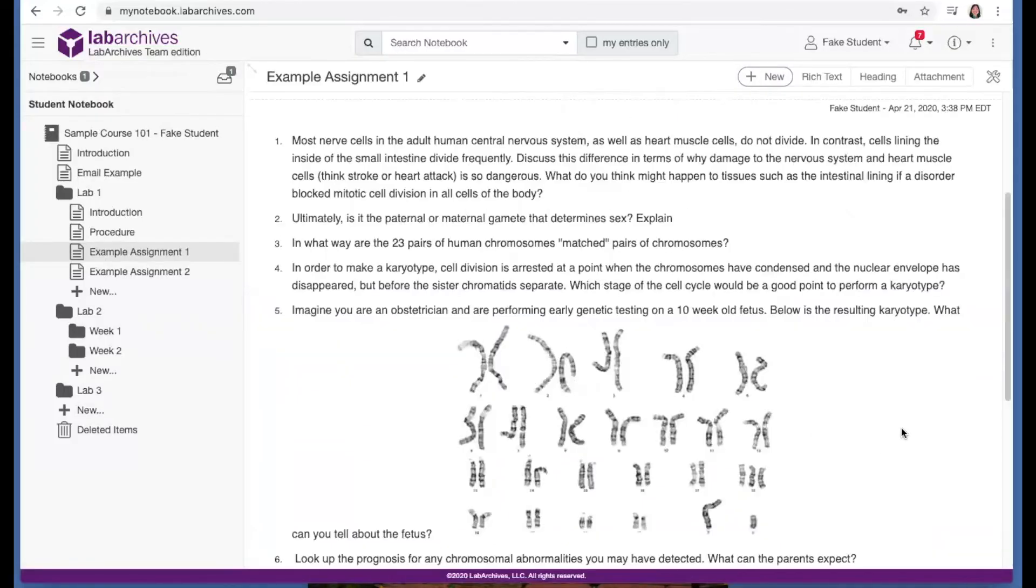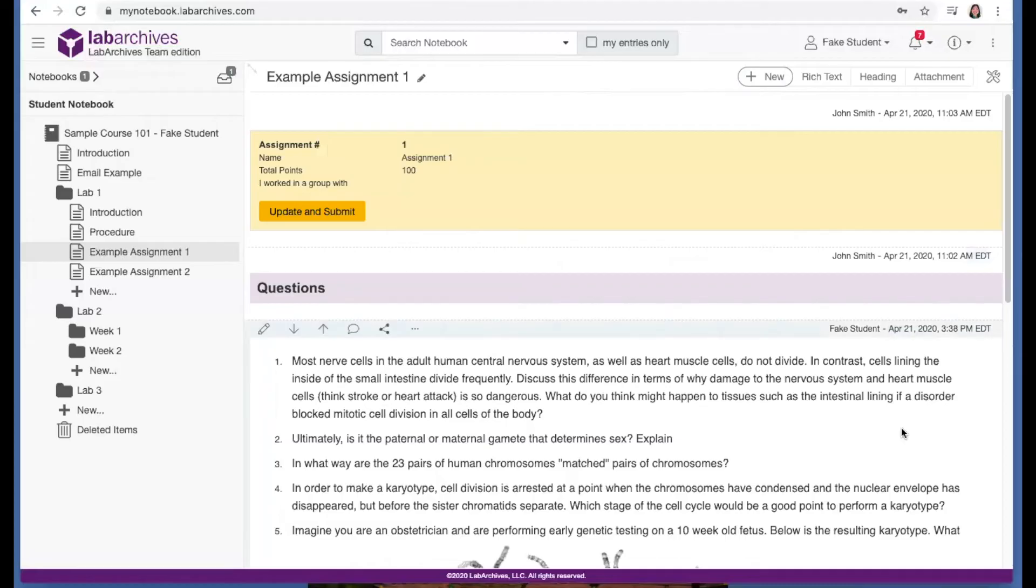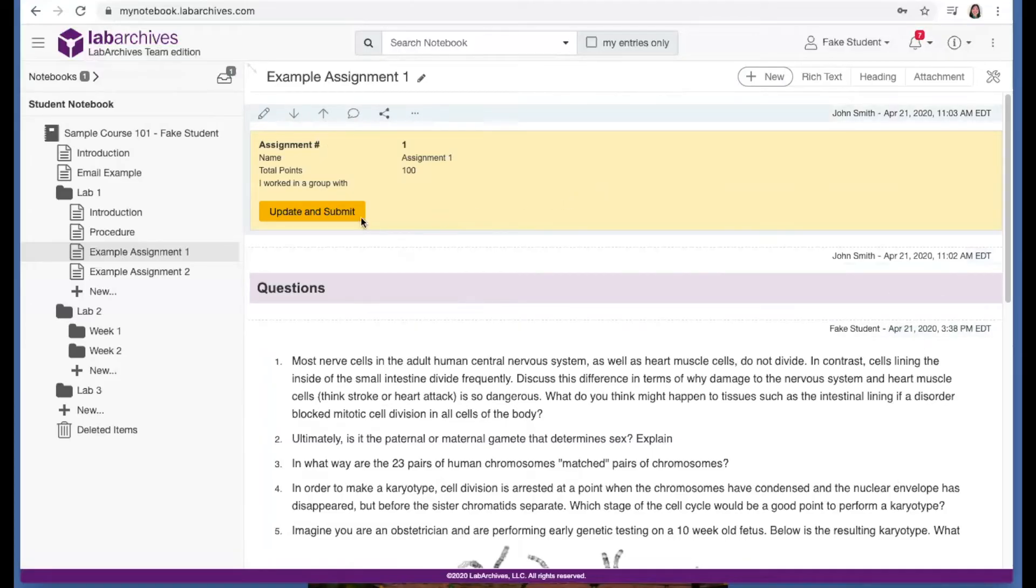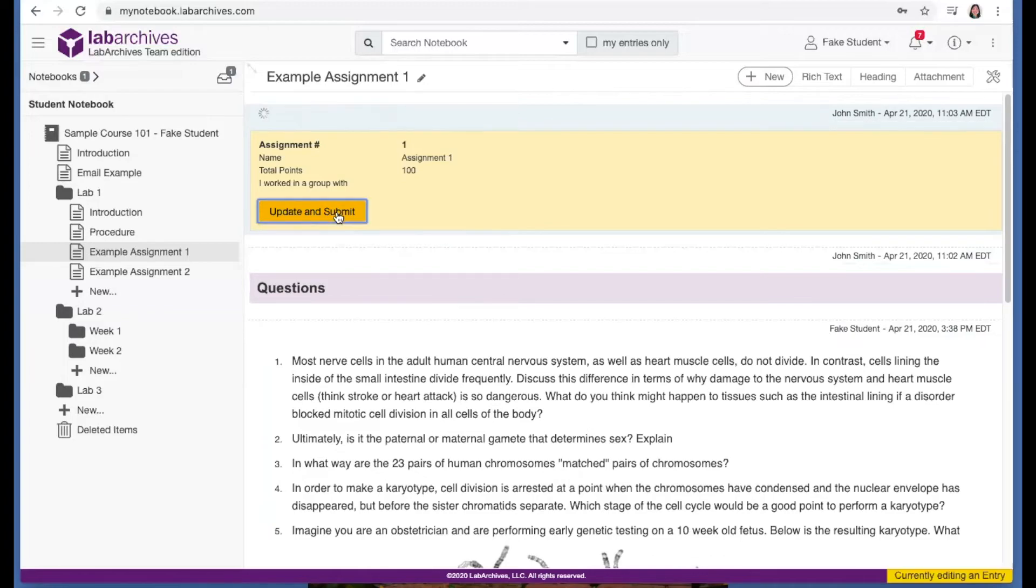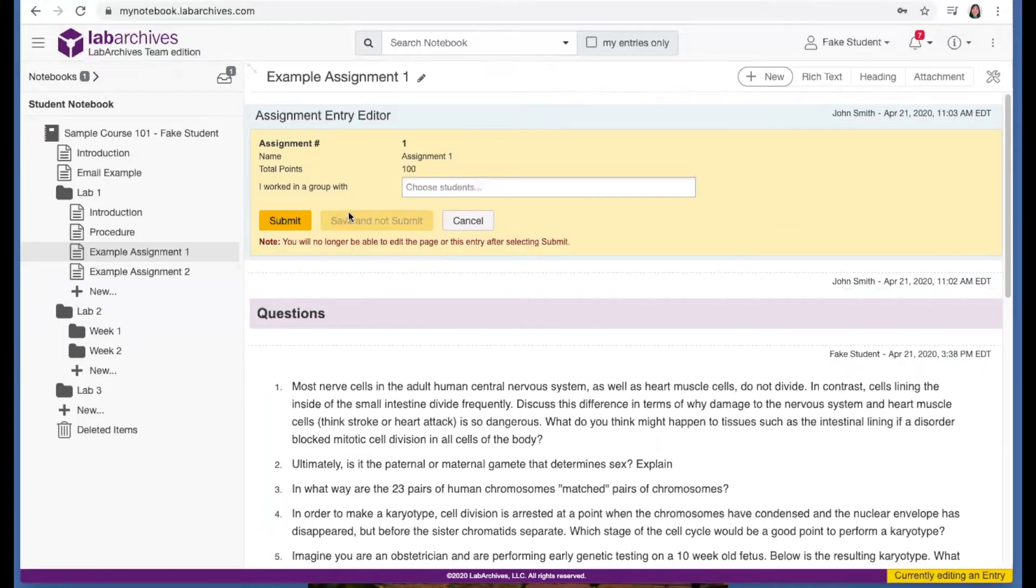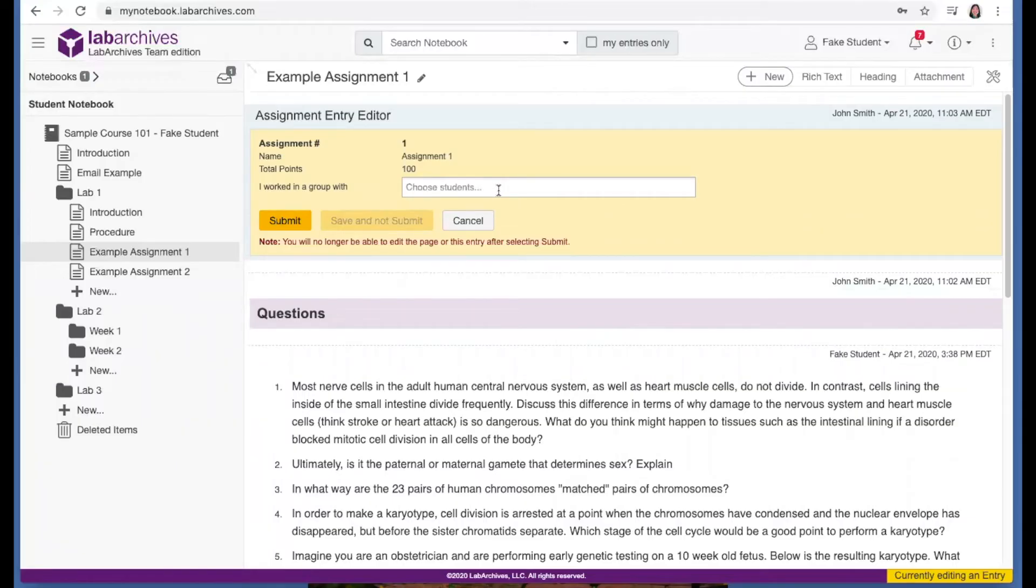Now when you're ready to submit the assignment, go up to the assignment entry and click this update and submit button. If you are submitting a group assignment, you can indicate your partners here, and then indicate which student's notebook the work is located.